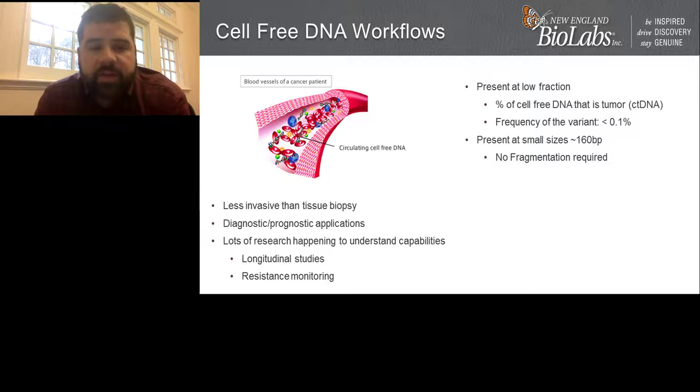And having technologies that are able to really push the conversion of molecules that are taken from blood and put that onto a library preparation or into target enrichment onto a sequencer to actually develop the depth of coverage that we need, and to do that as efficiently as possible because we want to get to such high sensitivity, low frequency variant allele fraction calling.